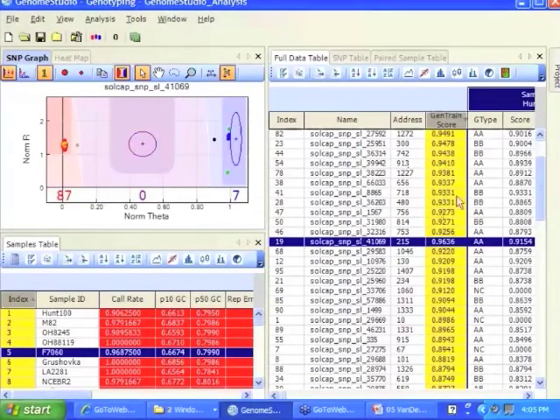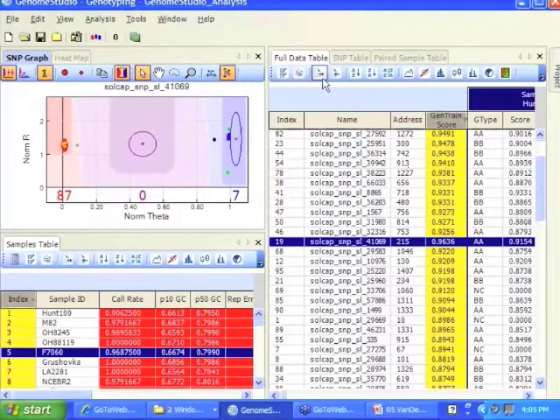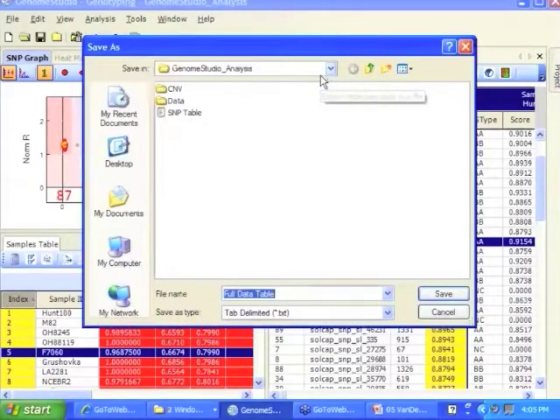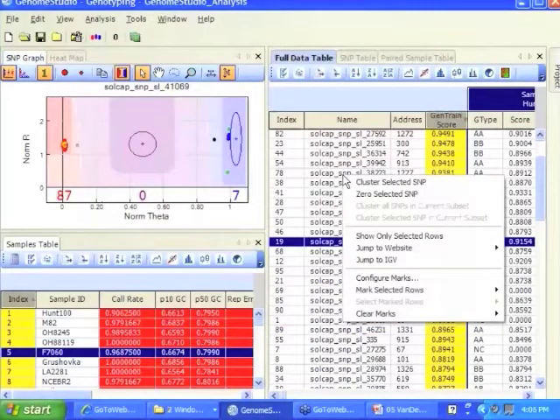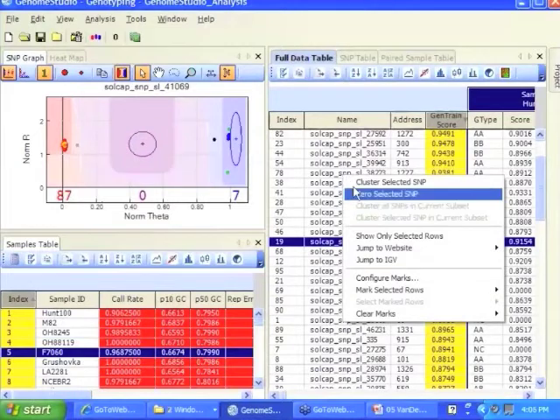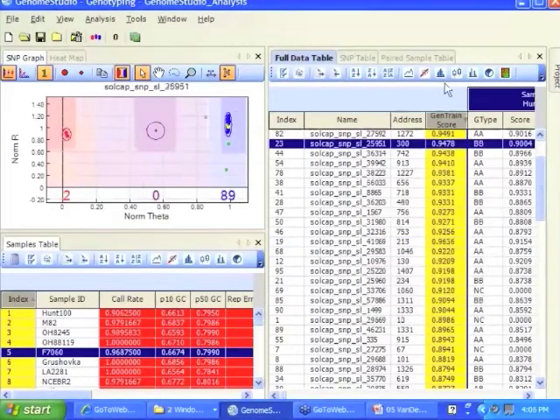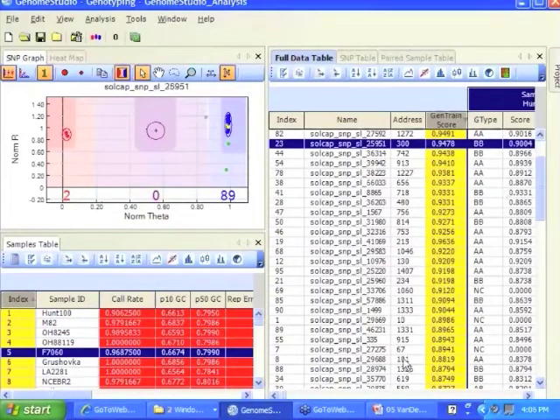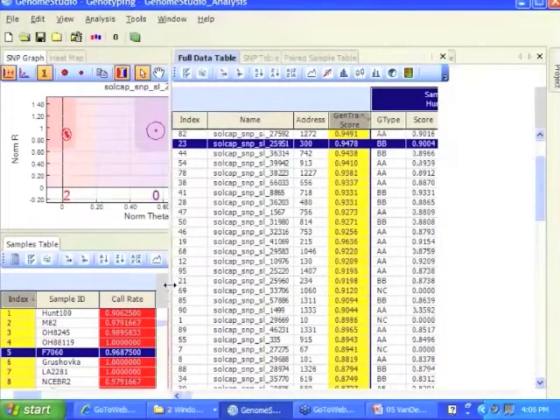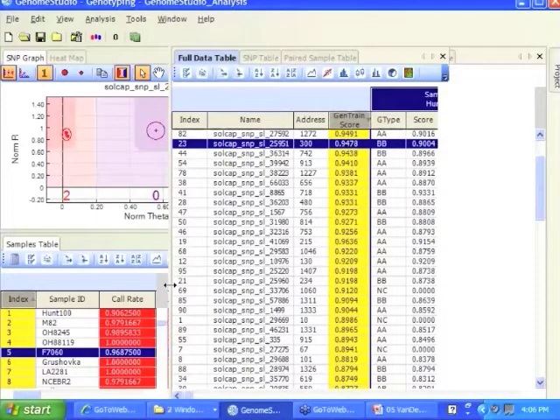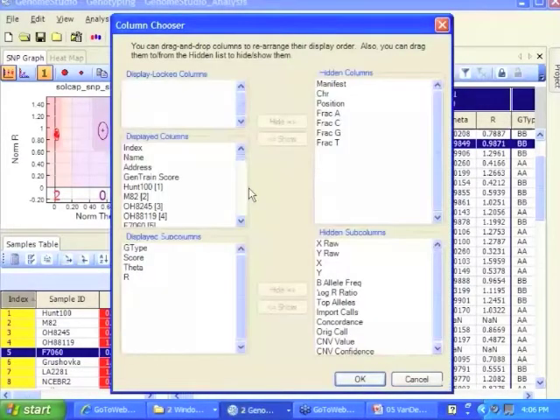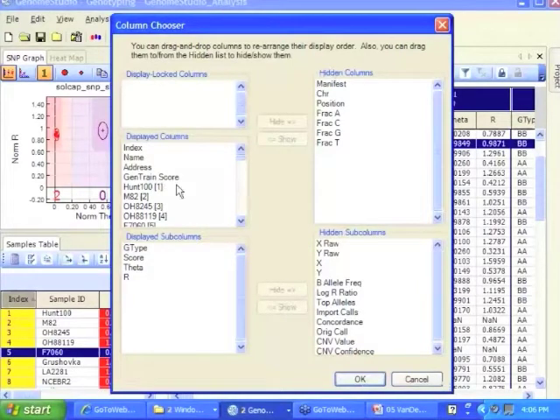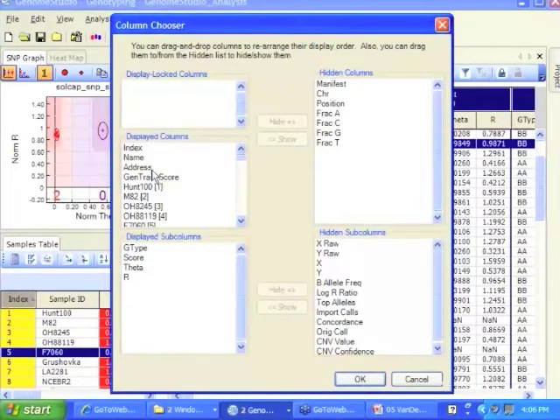So now I want to export my genotypes. I'm going to right click. I'm going to go to column chooser, which just appeared, this column chooser. And I'm going to write down what do I want to, I'm going to choose which columns I want to see.